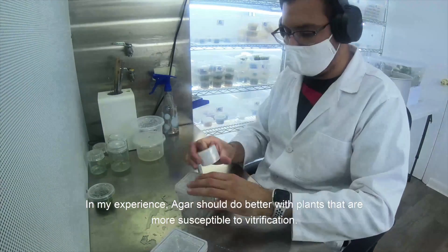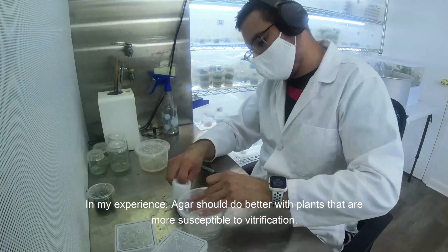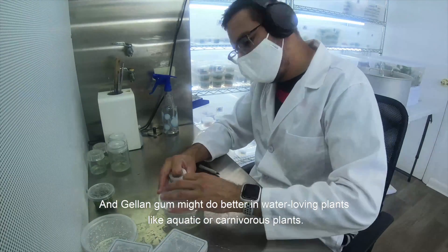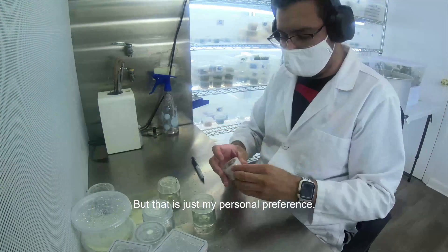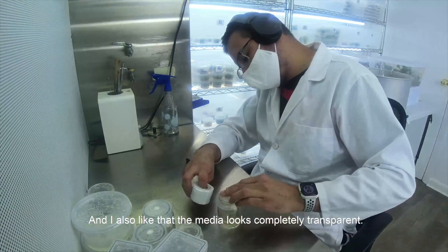In my experience, agar should do better with plants that are more commonly susceptible to vitrification, and gelangum might do better in water-loving plants like aquatic or carnivorous plants. That's why I use gelangum for my personal tissue culture plants, but that's my personal preference — I also like that the media looks completely transparent.